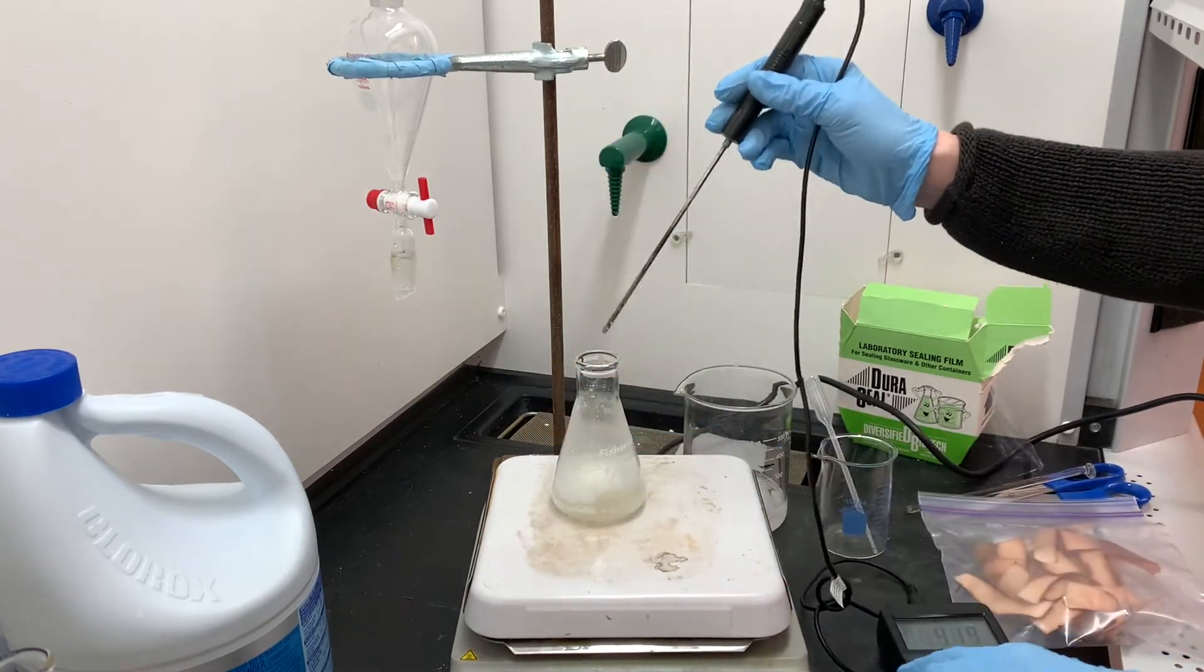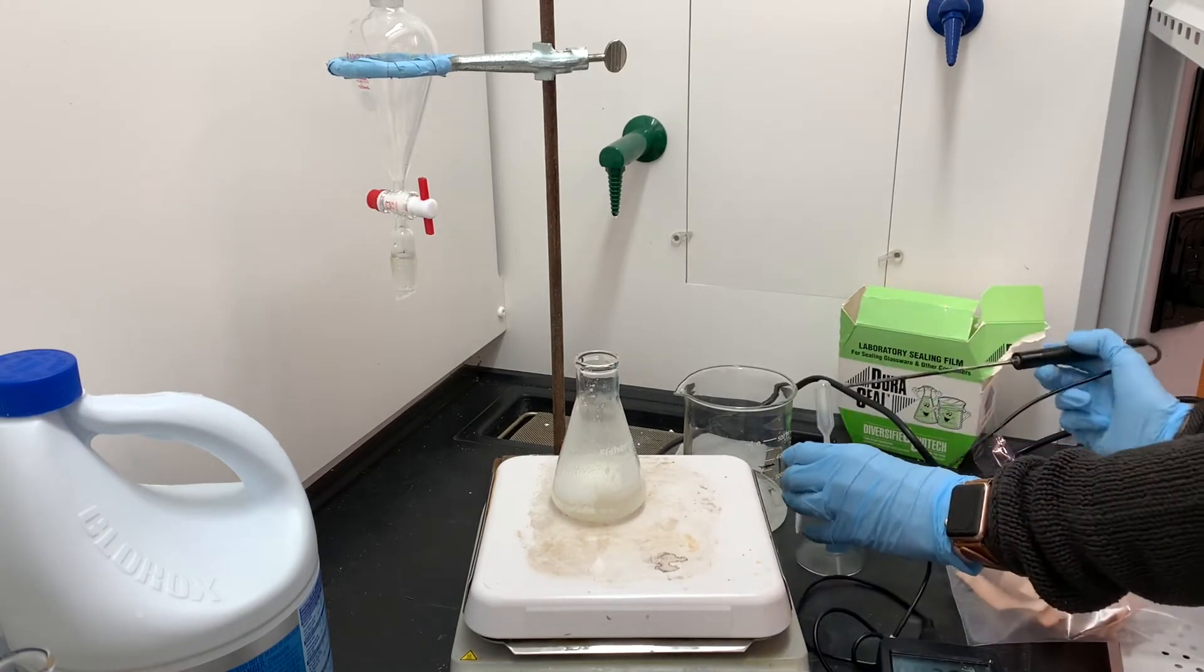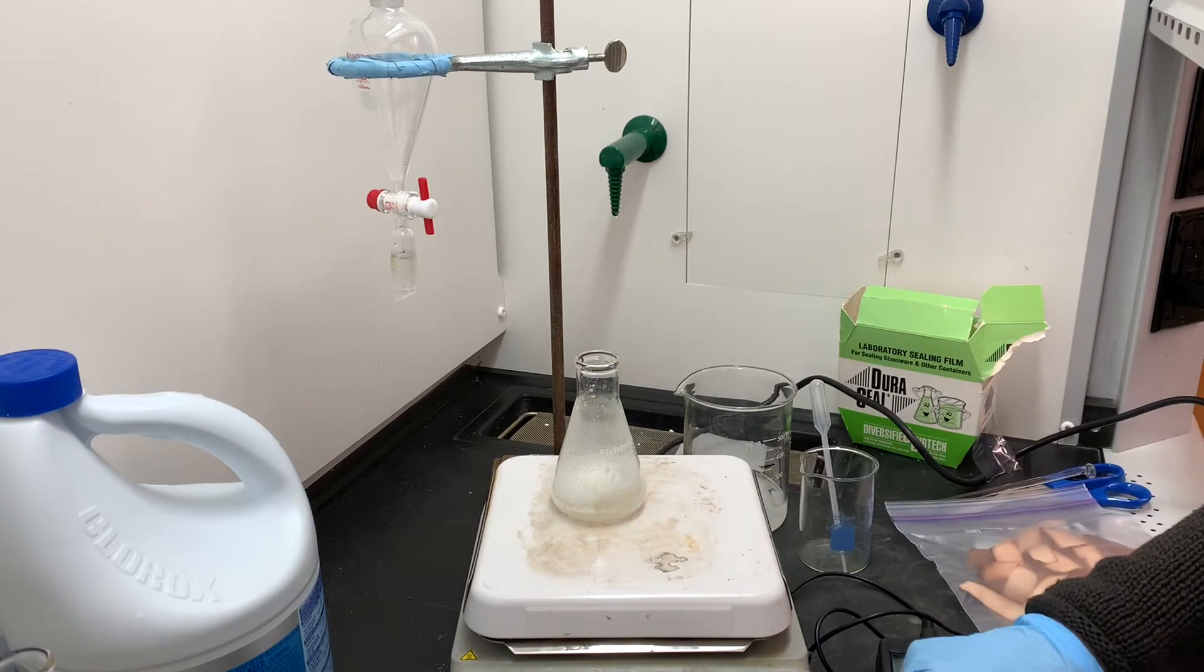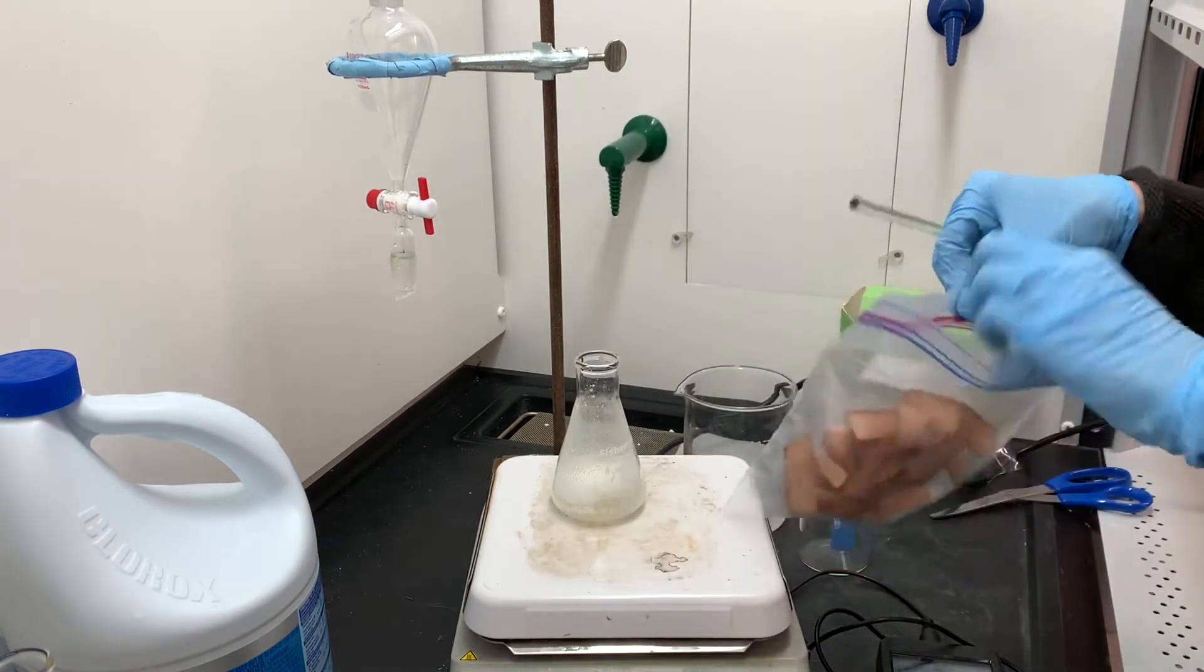It's important that we make sure that we always have excess bleach present in this flask during the 30-minute reaction period. I'm going to be monitoring the presence of excess bleach using starch iodide paper. This is kind of like pH paper.